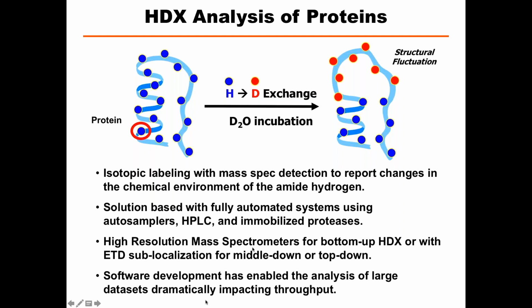We're also using high resolution mass spectrometers. This greatly facilitates the experiment because they have extremely high mass accuracy and high mass resolving power. That allows us to do bigger protein complexes without as much spectral overlap, but also we can rely on the mass measurement once we've identified the sequence that belongs to that ion, because it's going to be within a few parts per million, so we can always find it within the chromatogram and be confident that it's that peptide.